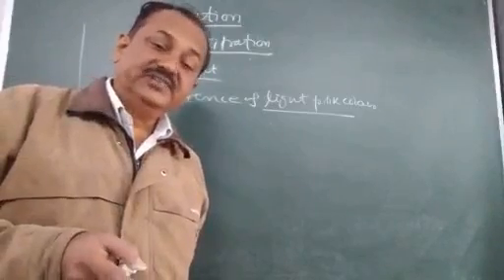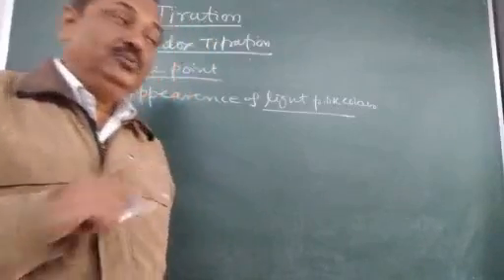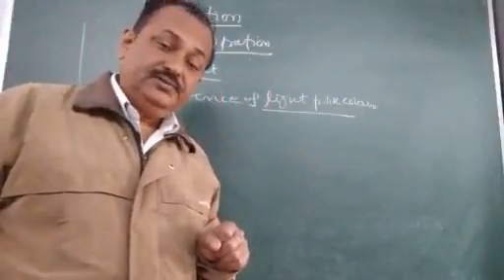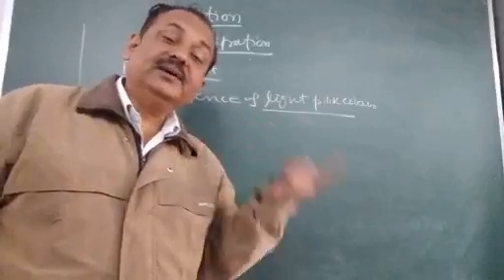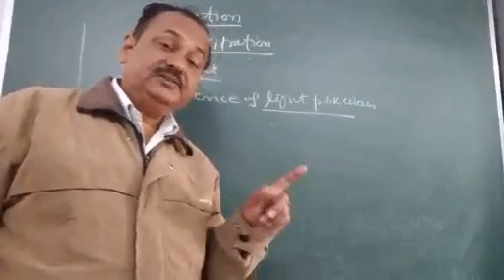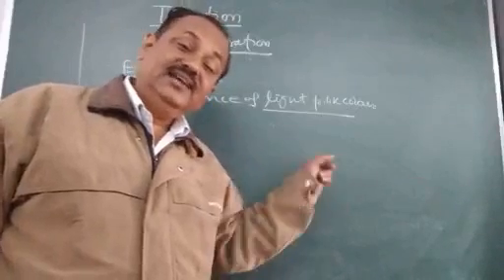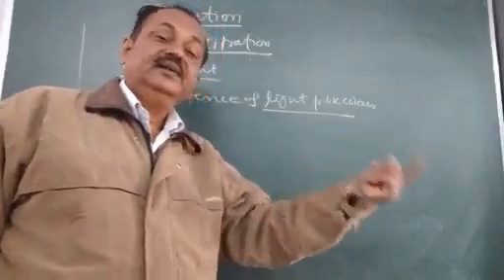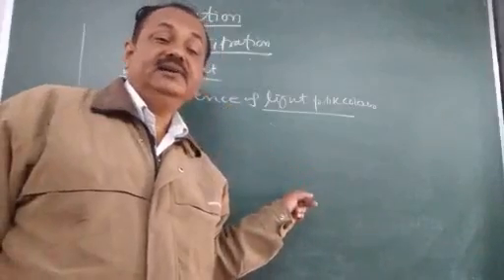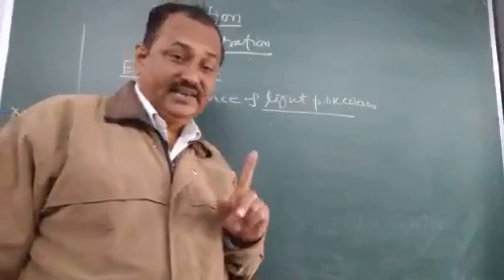The color of the Mohr's salt solution or the color of the oxalic acid solution becomes pink. And care has to be taken that if we add 1 drop more of KMnO4 in the pink solution, it will become more pink, and if a drop of oxalic acid is added, it will become colorless again. So this is a very important part in this aspect.